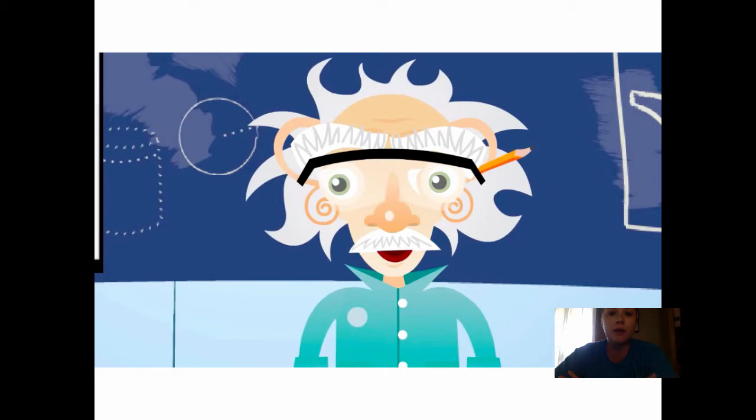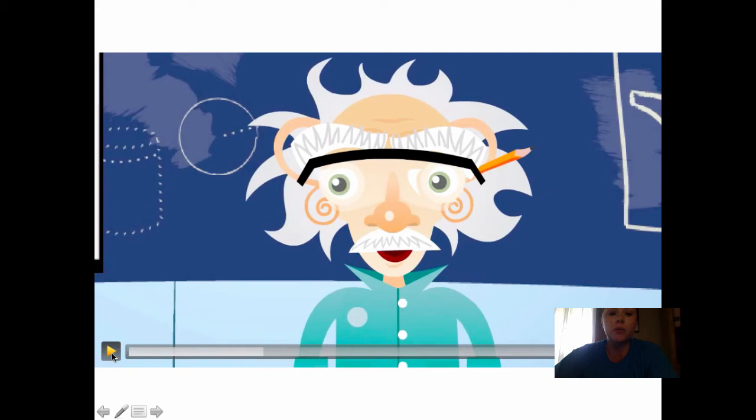So you should have those two things written in your notes. If you need to pause the video to write those two things, to not touch equipment until the teacher tells you to, and to wear goggles during lab activities, then pause the video and do that now. If you've already got those two, then you can move on and continue with the video.